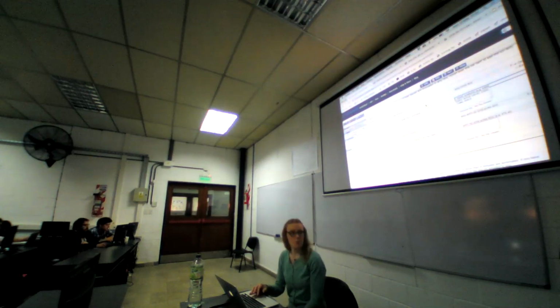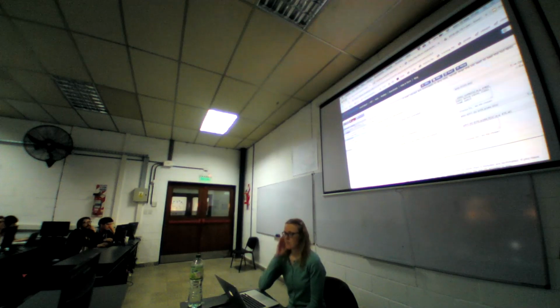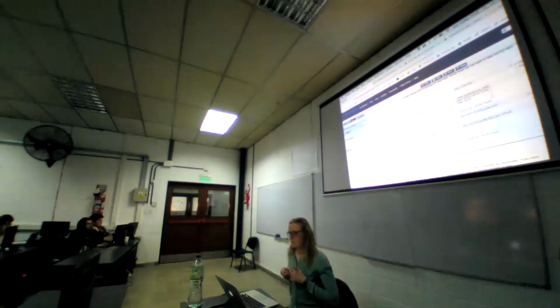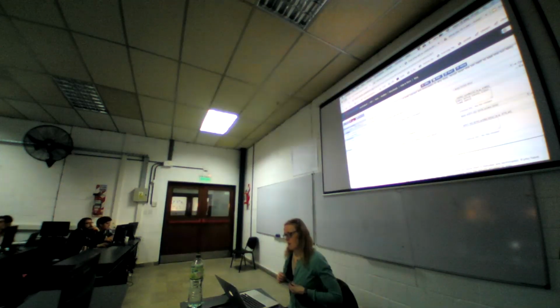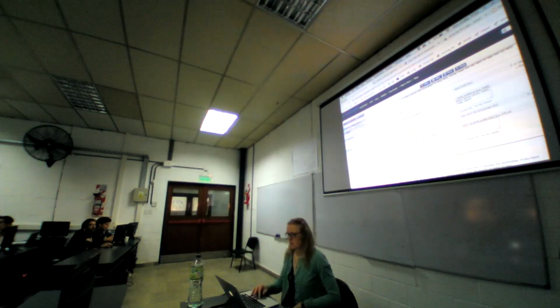You can, of course, upload a file here as well. So now I've selected my filters. I do a count, so I click on count at the top left to see if these have read correct. And if they have, then I should have 6 genes. Yeah, so now my data set is 6 genes. You can see this here.